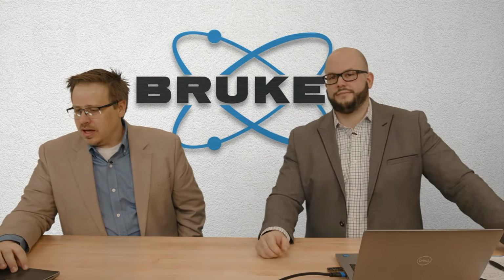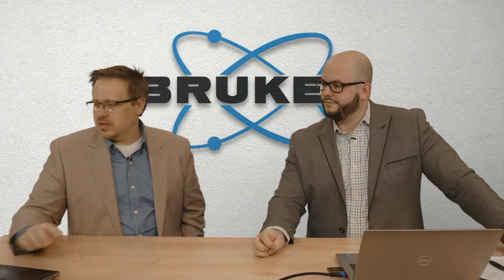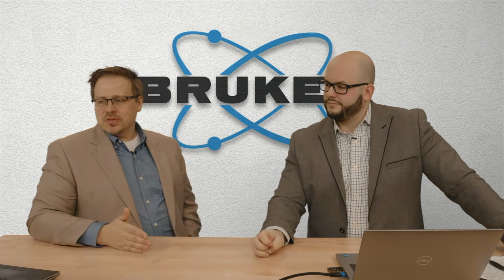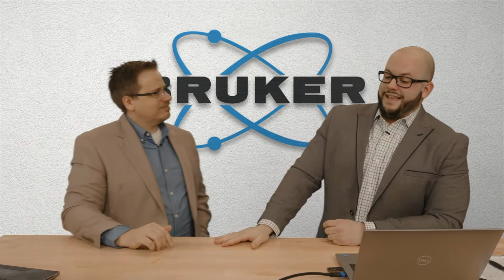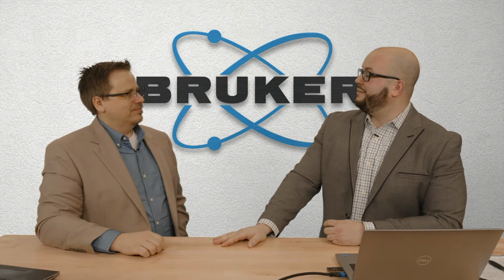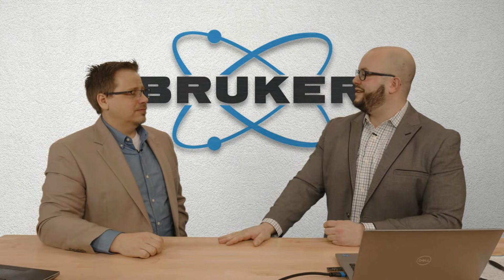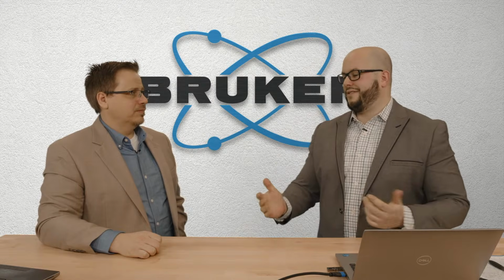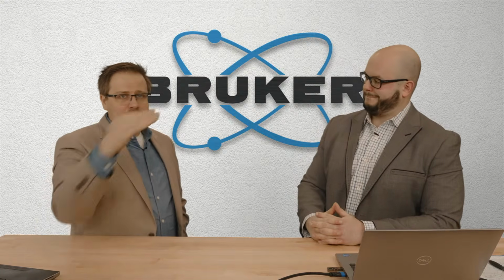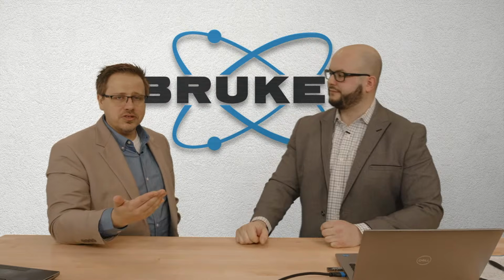All right. We got some questions that had come in before, so we're going to go to those, and then we'll come back to the ones in YouTube. From Susan: I have a heavily textured material. Can I use this method? It's going to be very difficult, especially if you're using a 1D approach. We're making the assumption that we have these infinite strain gauges, so you have to have randomly oriented crystallites. If you don't have the peak locations, then in that sine squared plot you're going to have some missing spots, or inaccurately positioned spots.